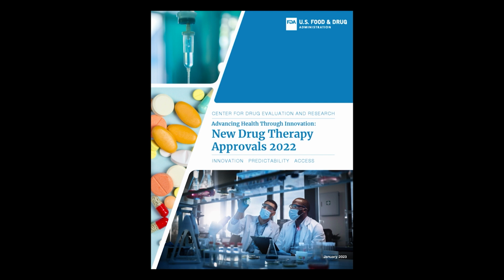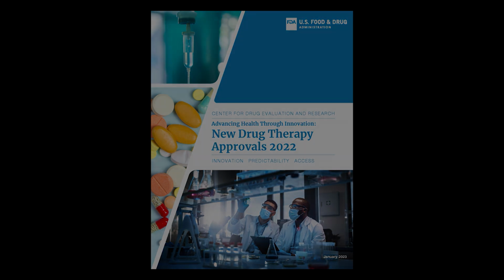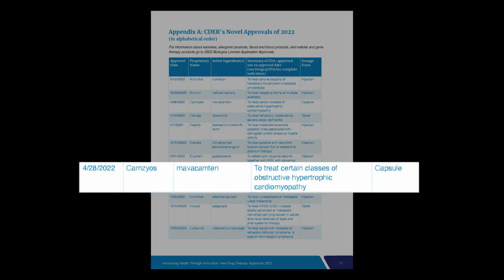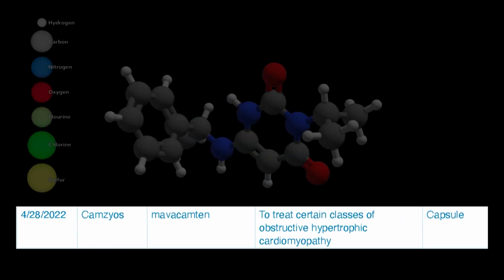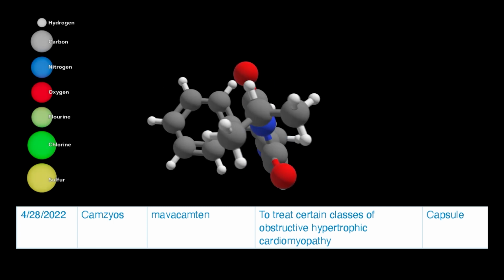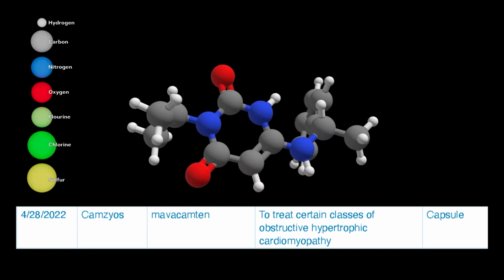These are a few of the drugs that were approved for 2022. As you examine these drug structures, be sure to note that all of these drugs are large labile compounds, susceptible to degradation under high temperature conditions, and the structures all contain conjugated pi systems. This makes HPLC the analytical method of choice.